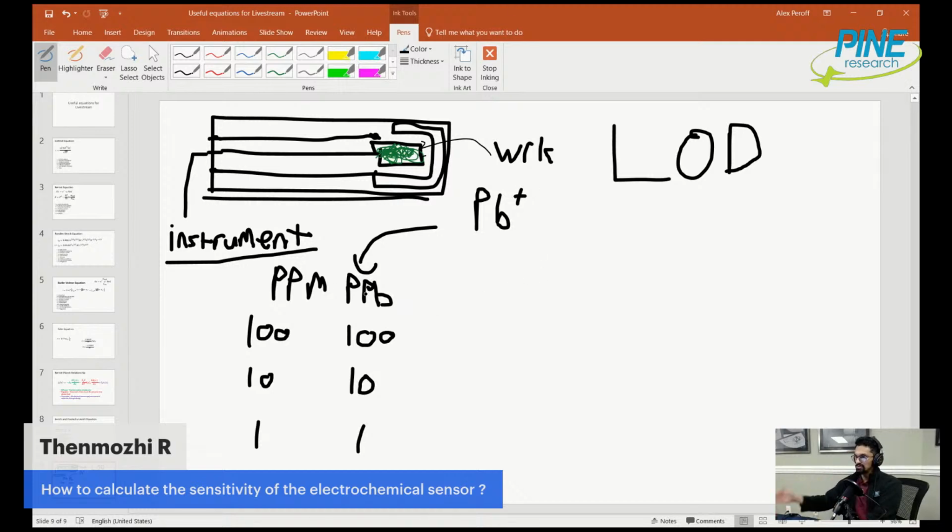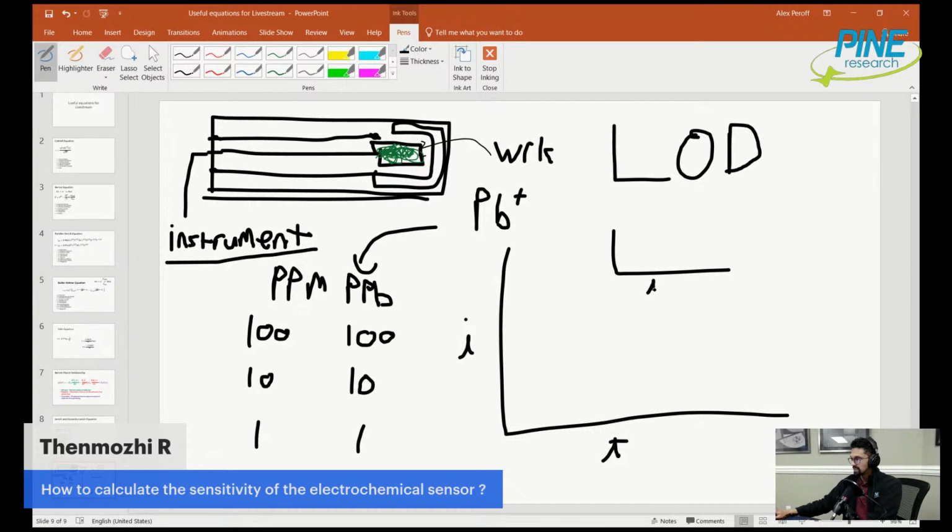And then you need to do an electrochemical experiment, or you may not even be doing electrochemistry. You could be doing spectroscopy. Chronoamperometry is actually a pretty good technique for this, used for quantitative analysis, because it's pretty fast. In chronoamperometry, you are stepping the potential and measuring the current as a function of time. So this is time. This is potential. We hold the potential at some value, and then we step it, and then hold it. And what we end up getting is a spike in the current, followed by a gradual decay.